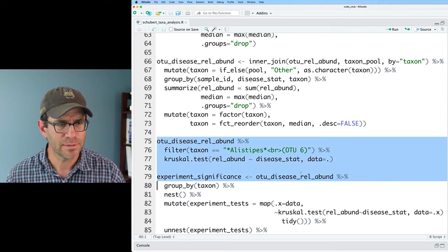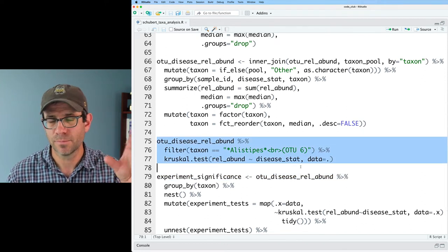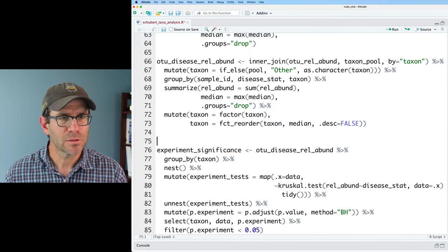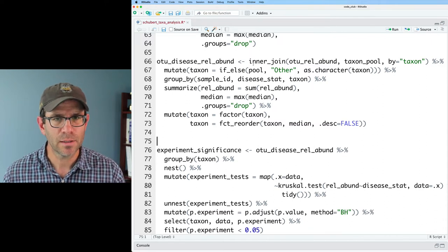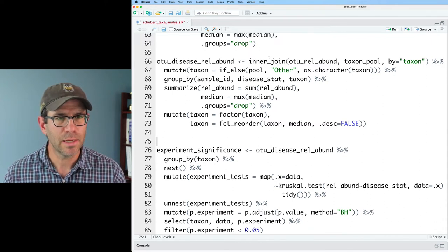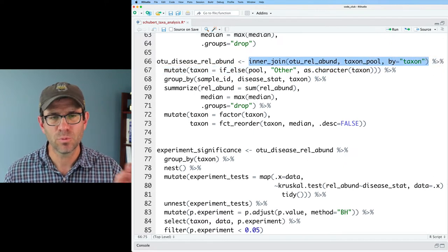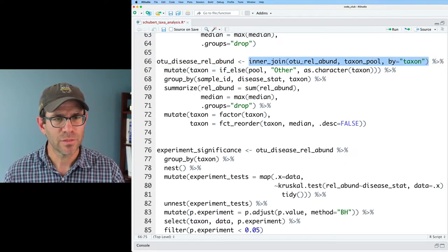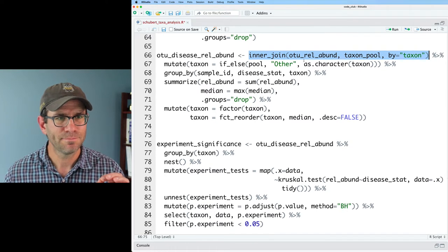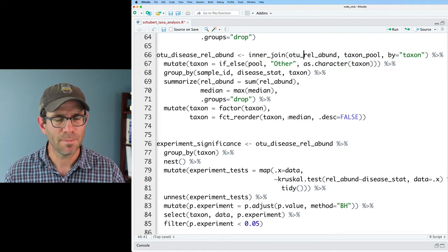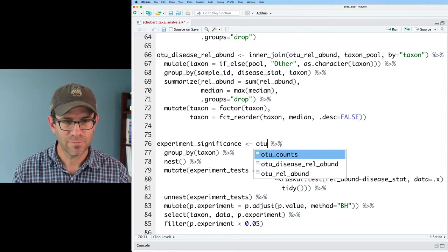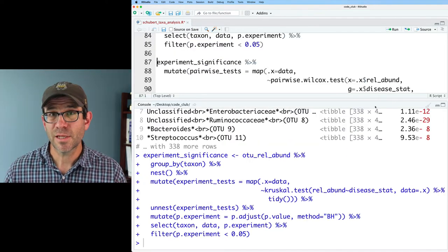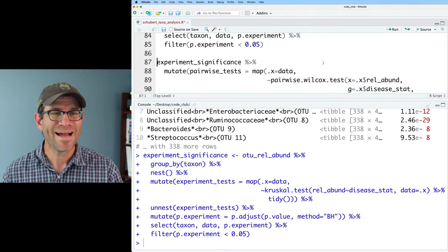I'll also remove these three lines that we had here for the kind of looking at one OTU. And so again, we did that pooling up here basically on our, with that taxon pool data frame. And so I think that we could do OTU rel abund as input to all this. So let's give that a shot.